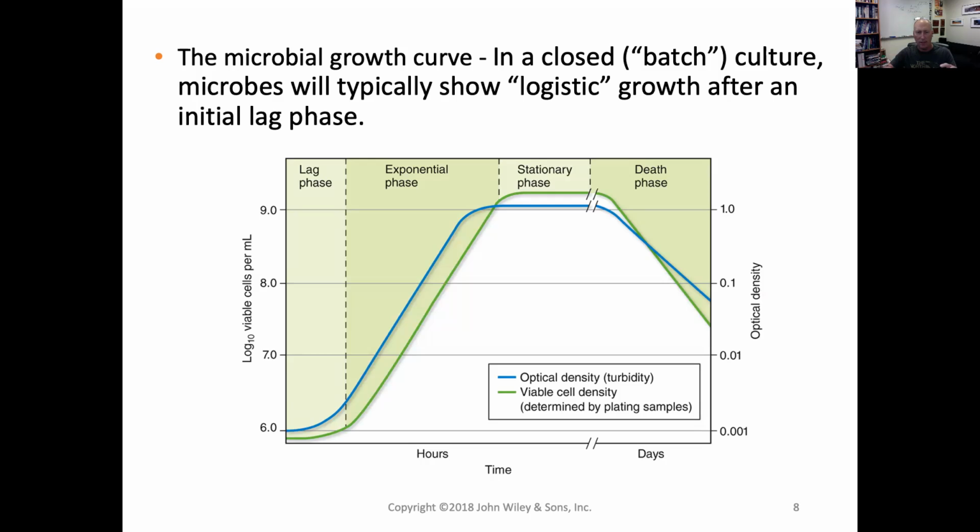So the nutrients that the culture has available is just what's there at the start. There's no addition of new nutrients. Now there is oxygen available. If they're growing by respiration, we're doing this in a shaking culture, so they're not limited for oxygen, right? But in terms of carbon, nitrogen, and that sort of thing, for incorporating into biomass, the amount of nutrients that are there at the start is basically what they have accessible.